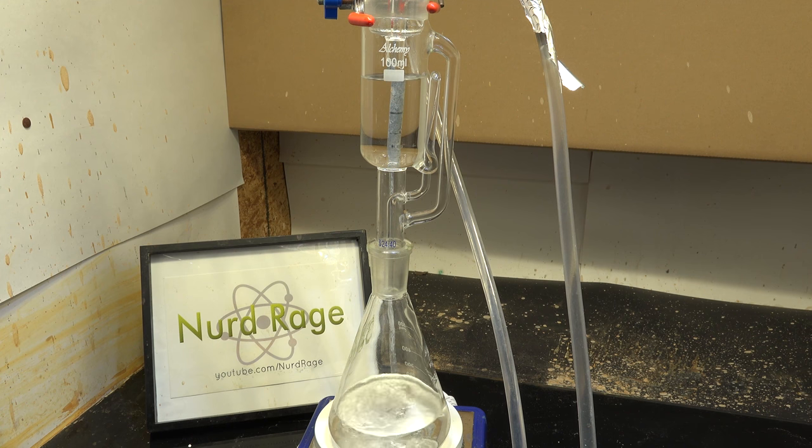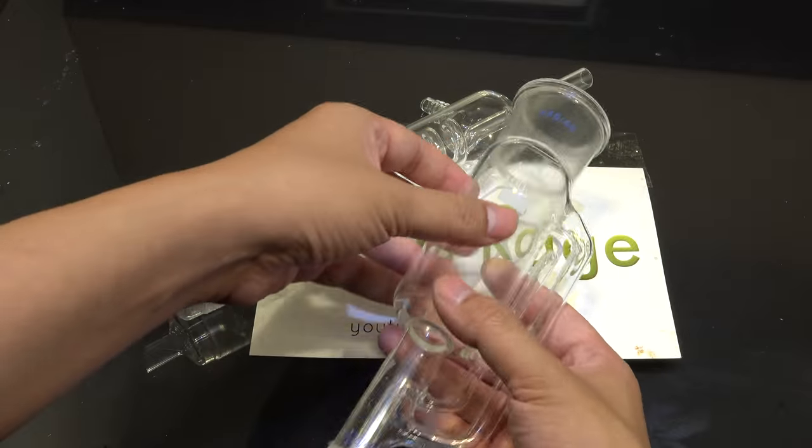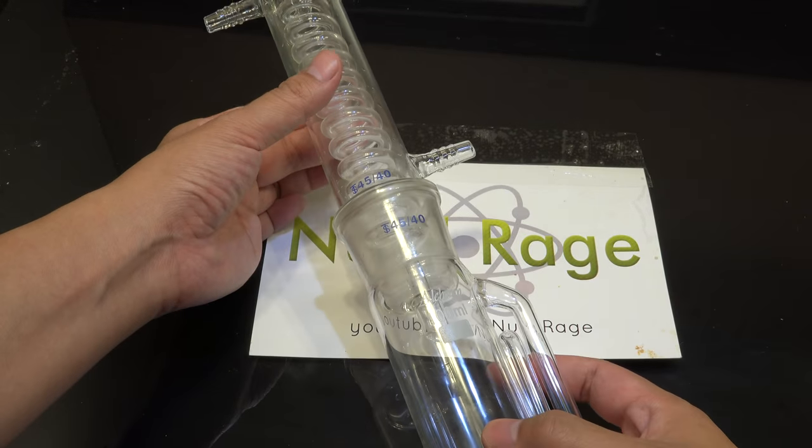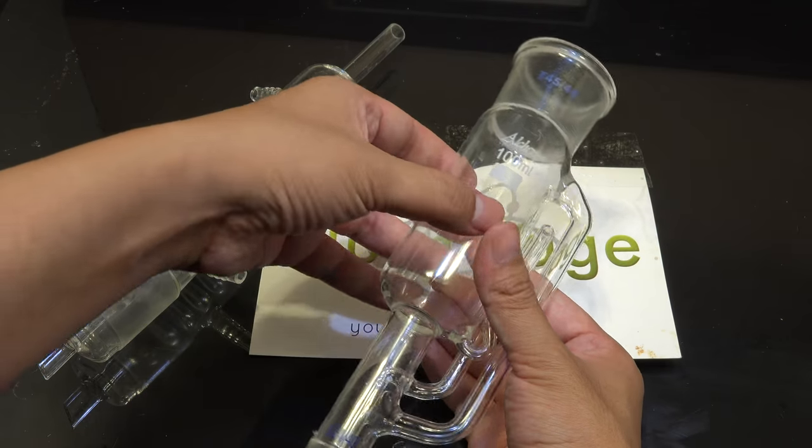A Soxhlet extractor fully automates this whole process. You can separate slightly soluble chemicals from totally insoluble chemicals using a small amount of solvent and repeat distillations. When you buy one, it usually comes with a condenser as well and fits on top of the extractor like this. Here in the extractor is where you put your mixture of chemicals.